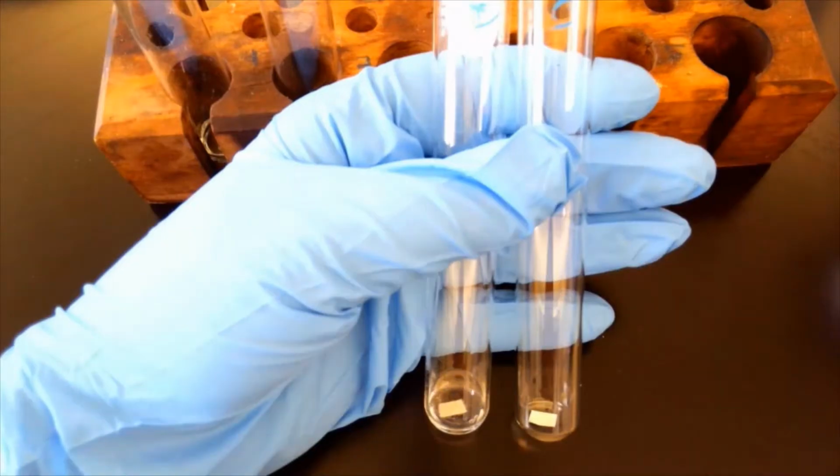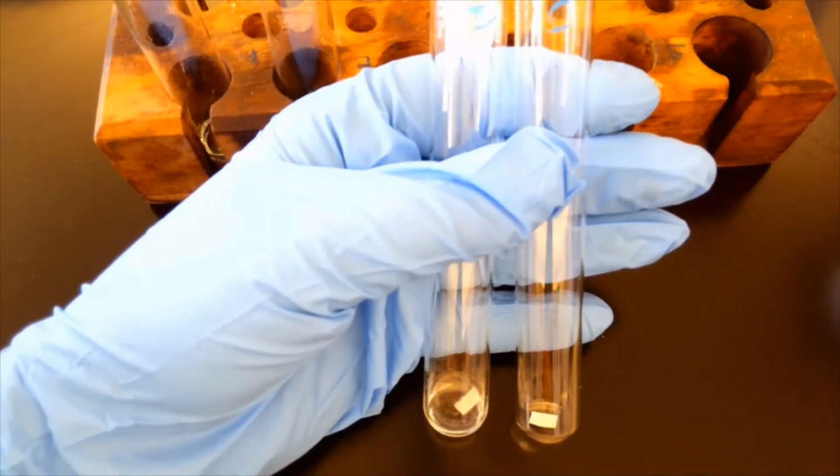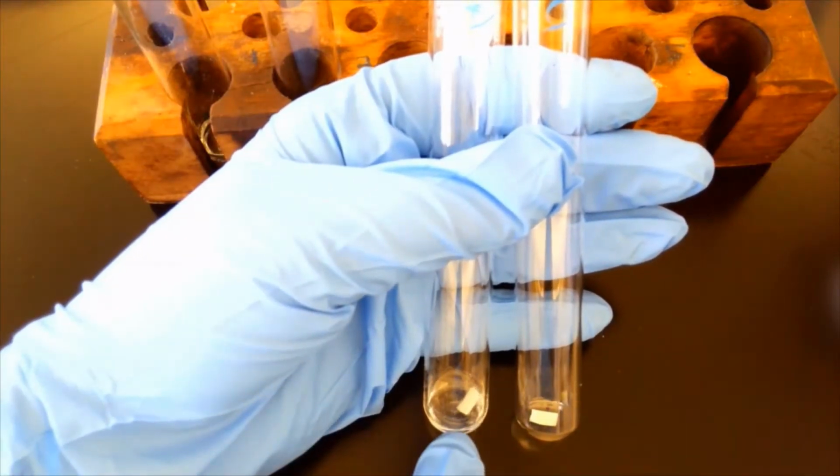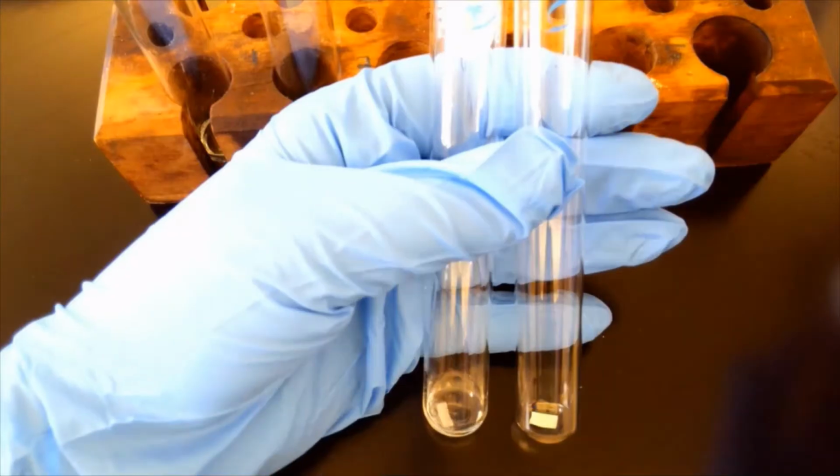And you can immediately see the bubbling. It's actually making the metal move. Again, we still have that strong vinegar odor, but there's our metal just bubbling around and moving. Definitely reacting a lot faster than it did with the zinc.